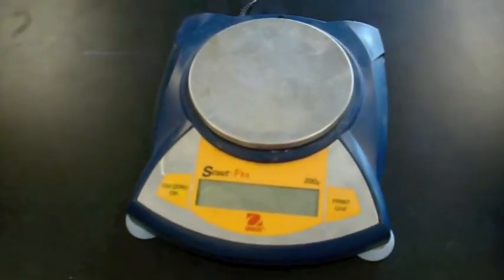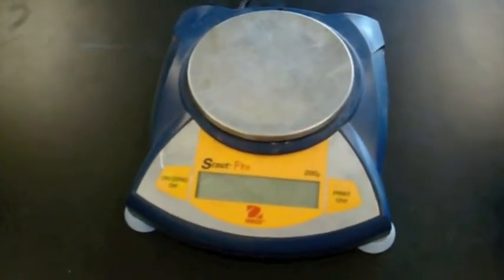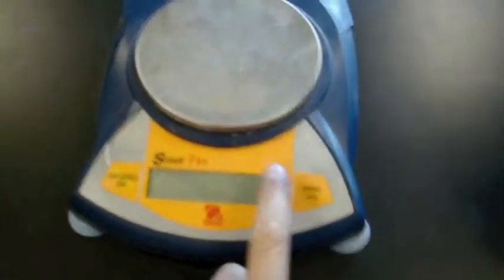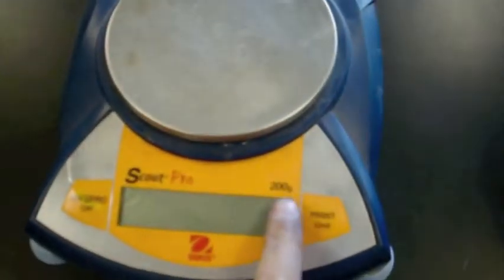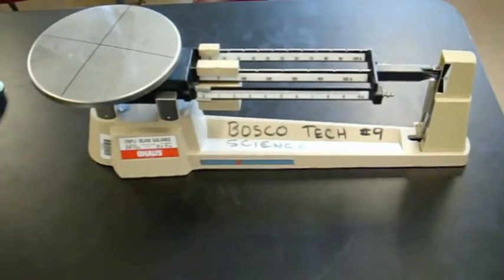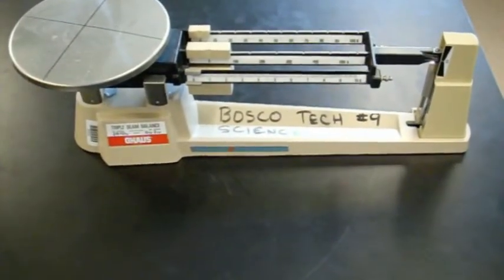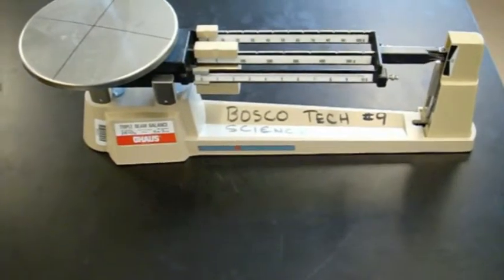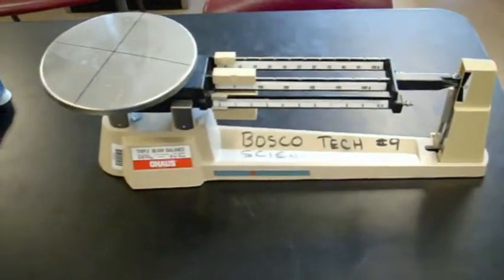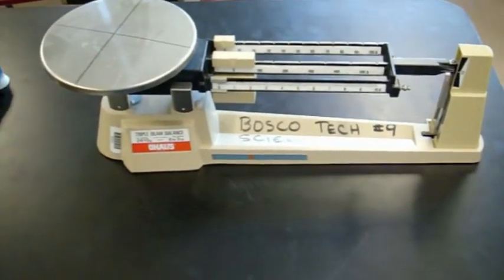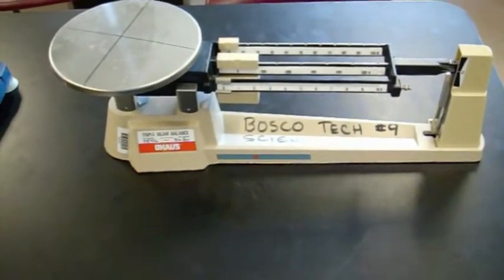Each of these balances has their own advantages and disadvantages. Just briefly, the electronic balance is more accurate than the triple beam balance, but it has a maximum capacity of 200 grams. So if we need to measure something more than 200 grams, we'll have to go over to the triple beam balance. The triple beam balance can measure up to several kilograms with some accessory weights. As it's configured now, it can measure up to about 610 grams.